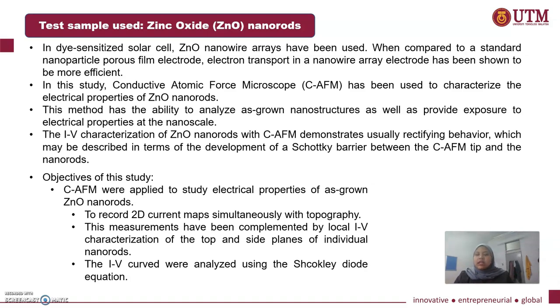The objective of this study is that CAFM was applied to study electrical properties of as-grown zinc oxide nanorods to record 2D current maps simultaneously with topography. These measurements have been complemented by local IV characterization of the top and the side plane of individual nanorods. The IV curves were analyzed using the Shockley diode equation.